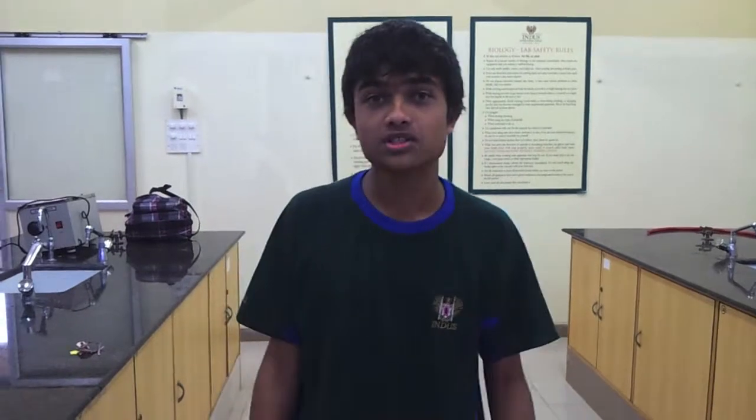Hello from the Indus Biolab. We're going to perform an experiment with the kids from IICS, that is the Indus International Community School, giving an IB level education for each of these students. What we're going to do today for the YouTube Space Lab video is demonstrate a titration experiment. This exact experiment, with some specifications, shall be suggested to be performed in space.